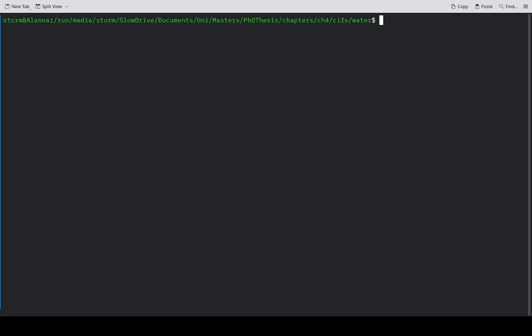So, as you see, that is very easy on the bash command line. That'll be almost identical on any other command line like CSH or KSH. This will work on Linux. This will work on Mac. This will work on Windows under the Linux for Windows subsystem.